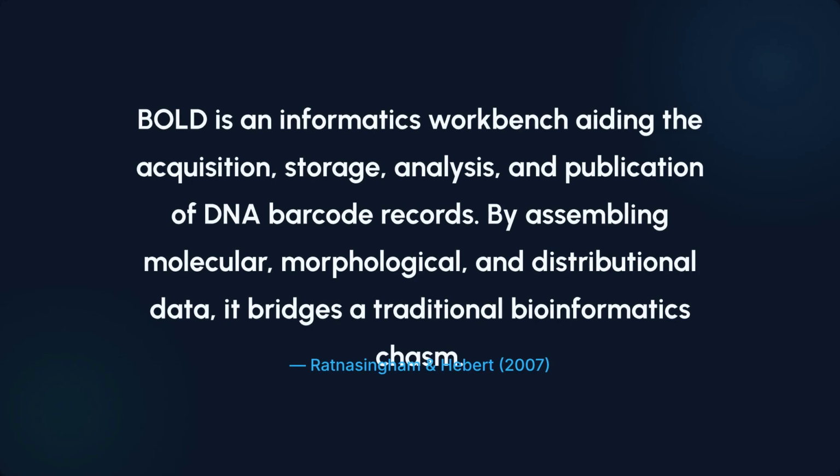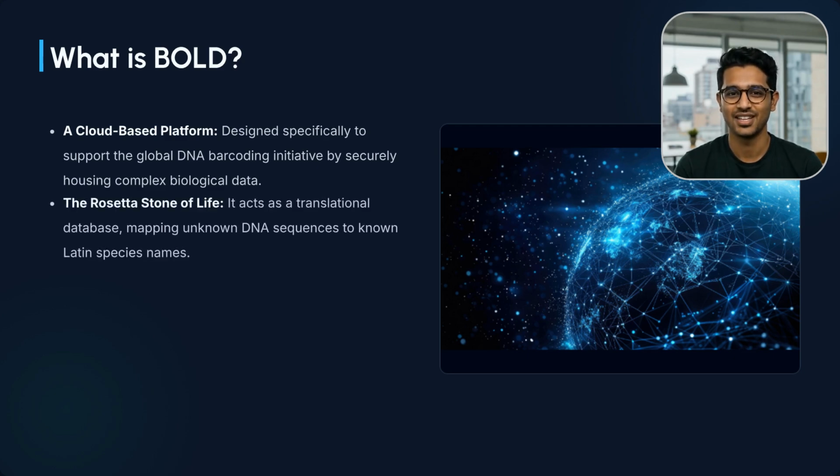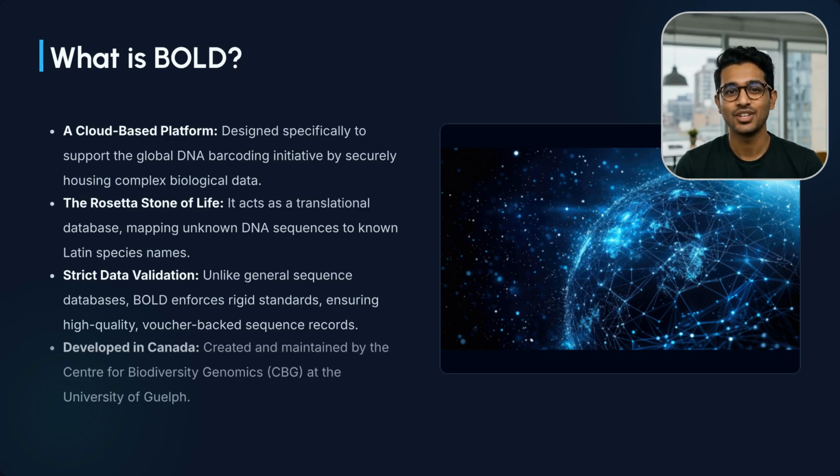BOLD serves as an informatics workbench, supporting the acquisition, storage, analysis, and publication of DNA barcode records. It bridges traditional bioinformatics by assembling molecular, morphological, and distributional data. BOLD is a cloud-based platform for DNA barcoding. It acts as a Rosetta Stone, mapping unknown DNA sequences to Latin species names and enforces strict data validation. It was created and maintained by the Center for Biodiversity Genomics in Canada.